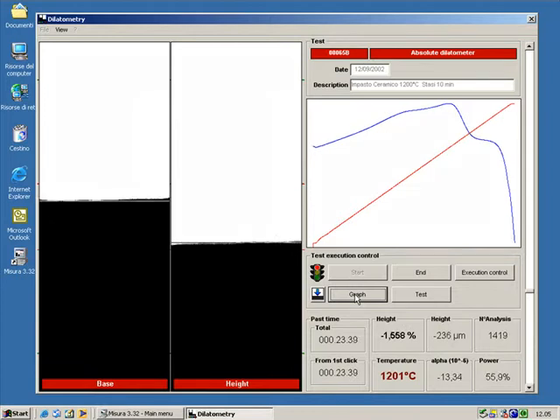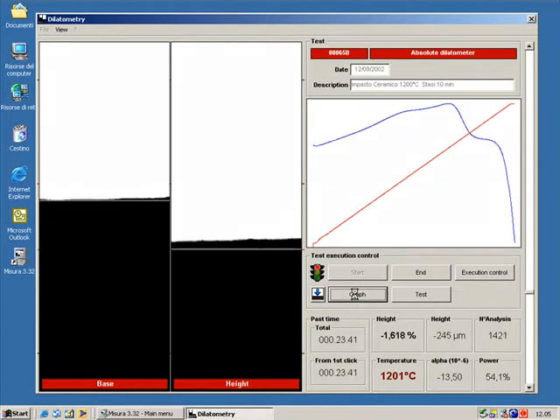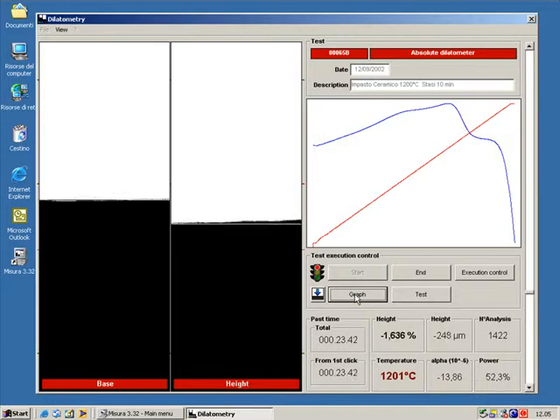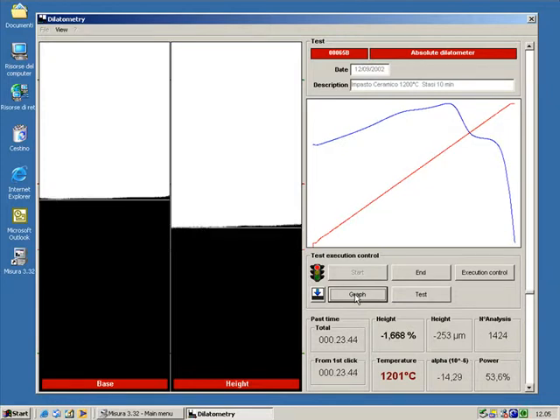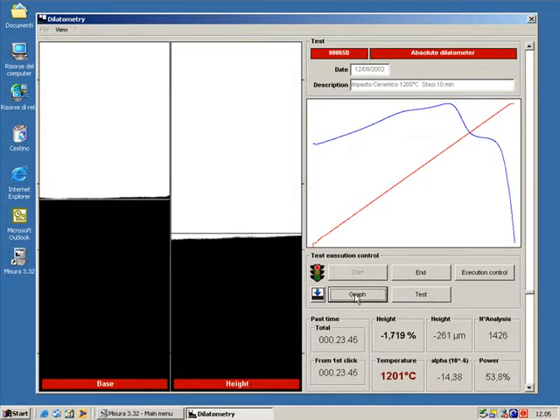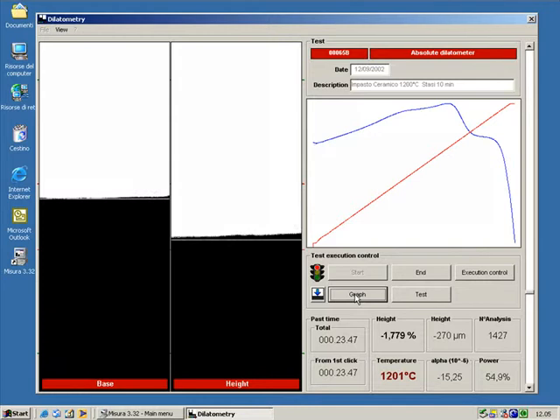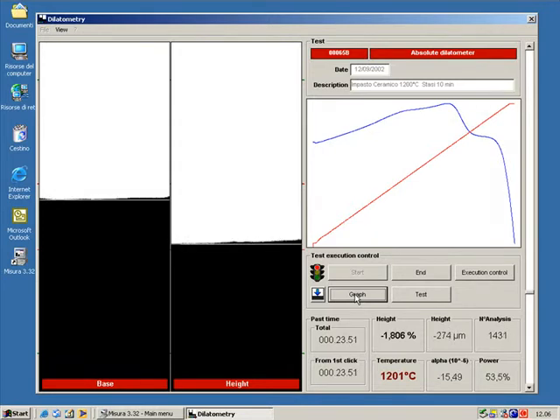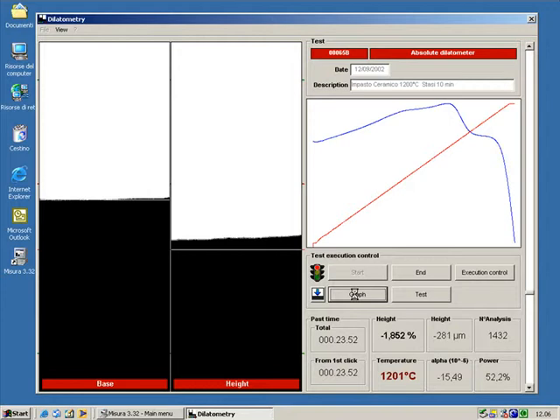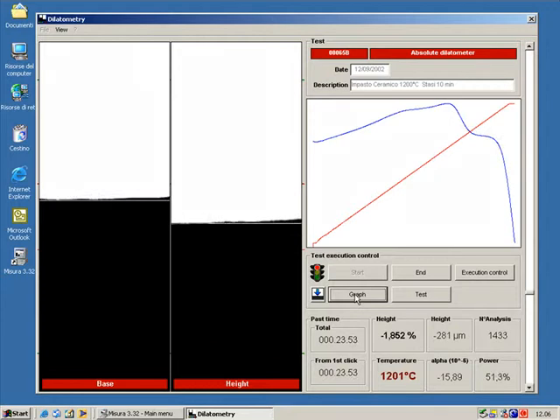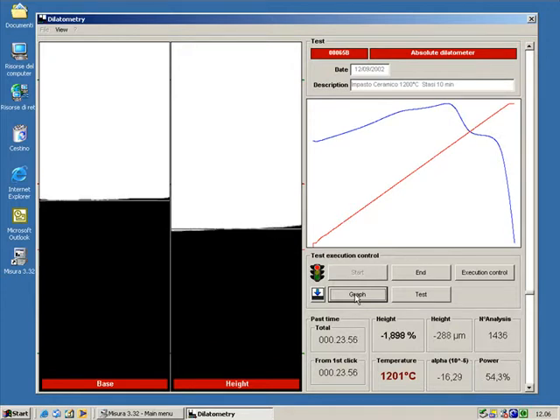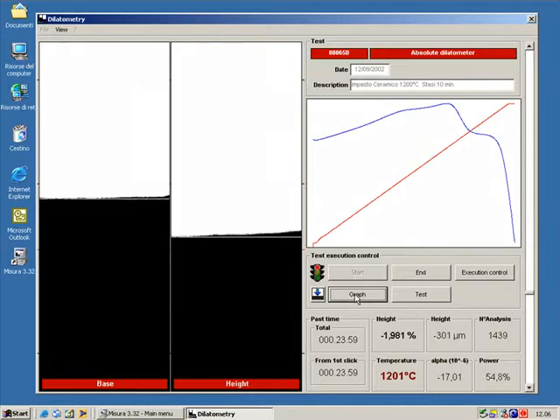The thermal treatment set for this test is made of three steps: heating up to 1200 degrees centigrade at 50 degrees per minute, holding the temperature of 1200 degrees C for a period of 10 minutes, and then cooling.